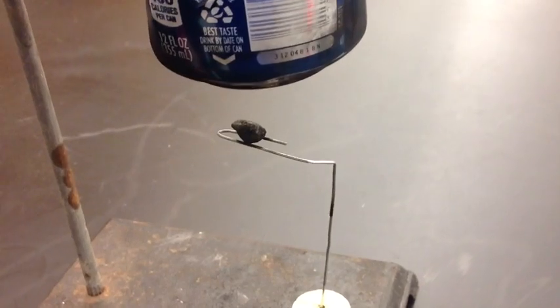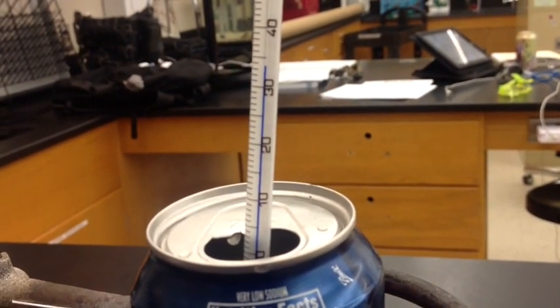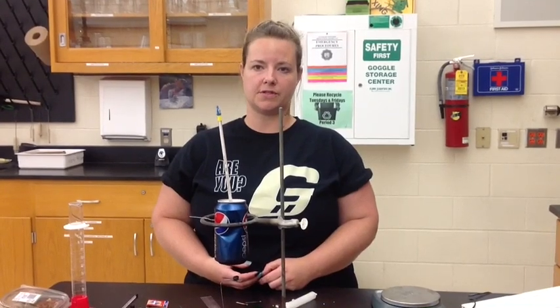Now that the peanut is completely burnt, you're going to check your ending temperature on your thermometer. For the data for the peanut, you're going to record a temperature of 33.5 degrees Celsius. You will be conducting this lab with three other food sources.